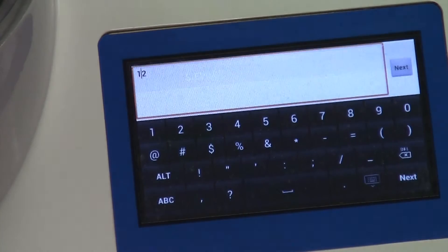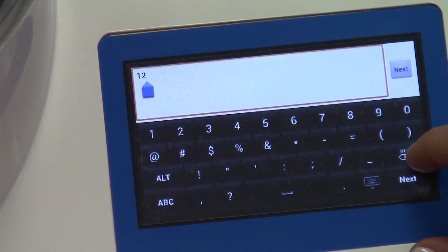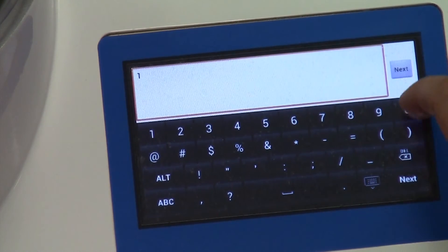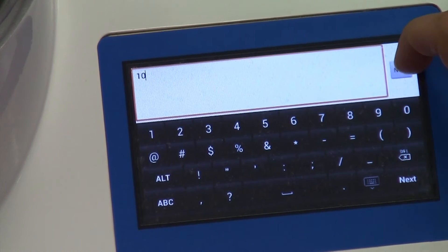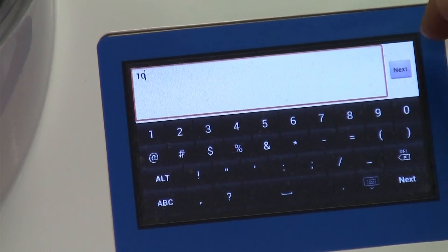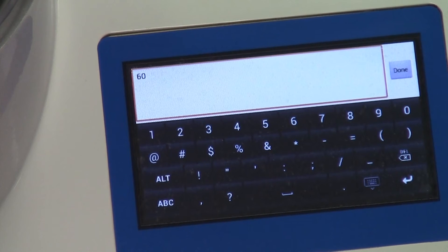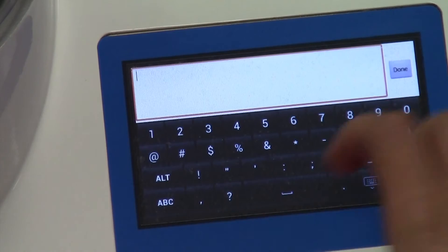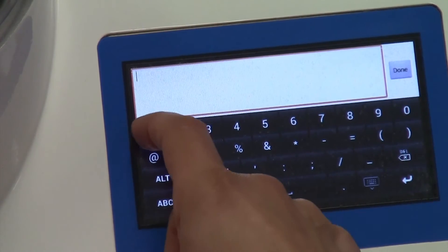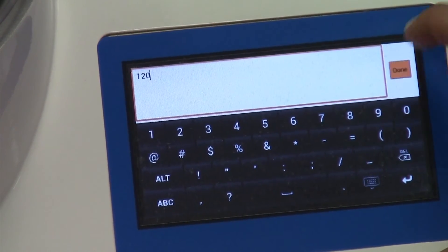In order to enter it in, you're going to select the cell and enter the sieving pressure that you desire. Then you're going to press next. It'll automatically populate to the sieving time screen, and we're going to enter in 120 seconds. And then you're going to press done.